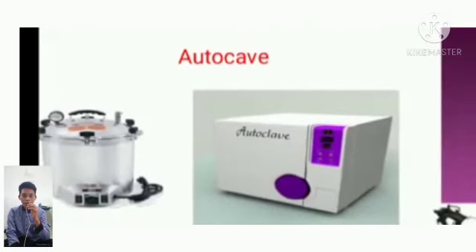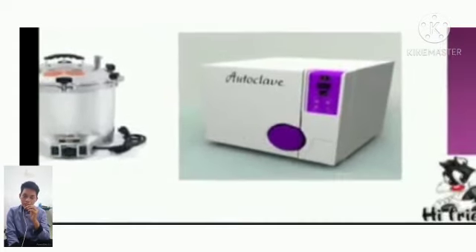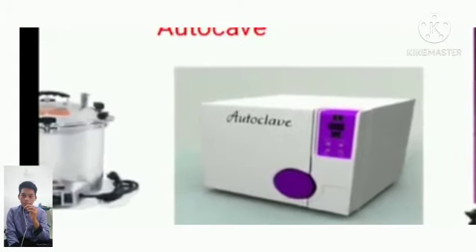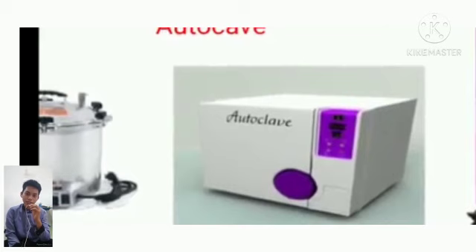The picture on the right is a digital autoclave. It's a type of autoclave with IC use or operation, because it is equipped with a digital panel for the controller. It could control temperature, pressure, time and cycle information.